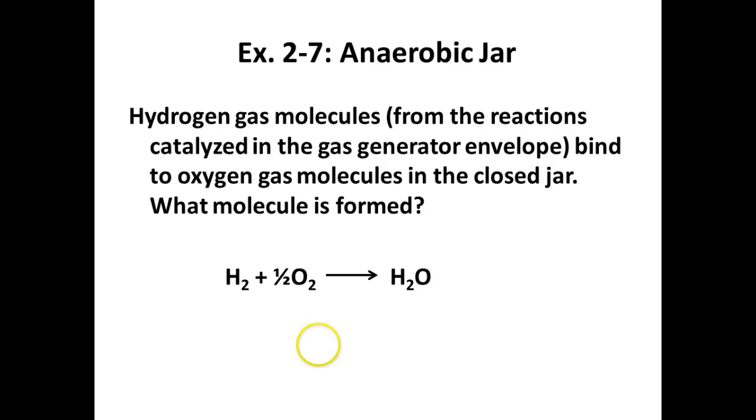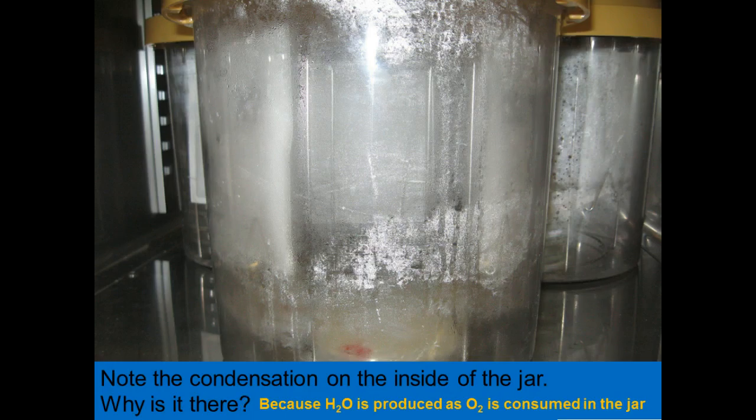So another picture you'll see, right? You see the condensation inside? That's the formation of that water as the oxygen is being consumed by the combination of the hydrogen and oxygen gas. So that's another good indicator, right, that things are working properly as they should.